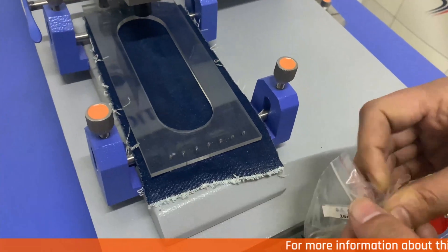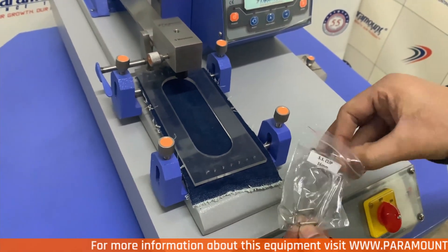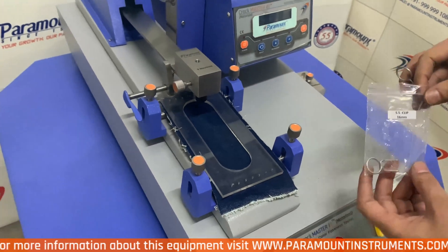After your sample is fixed, we will then fix the crocking cloth to the finger with the help of the SS clips provided with the instrument.